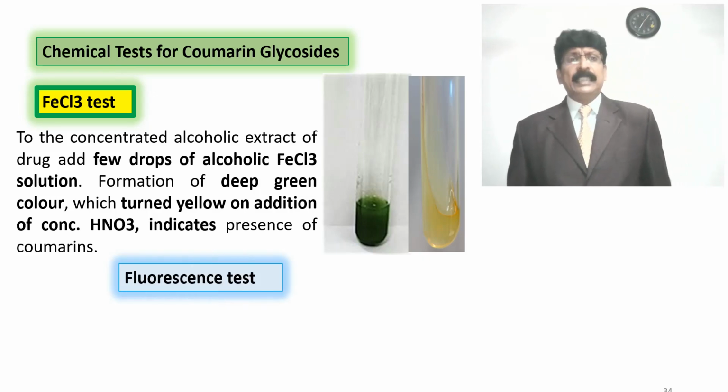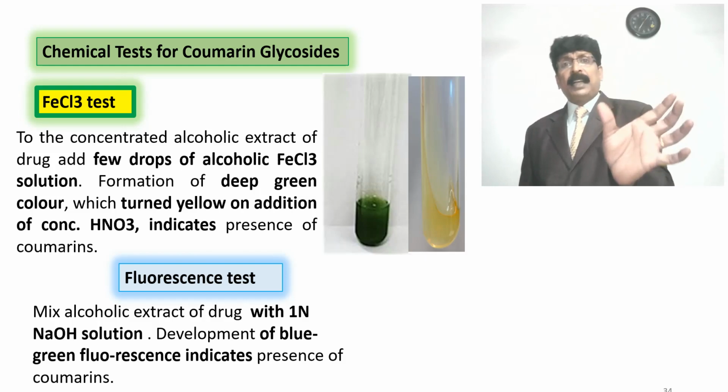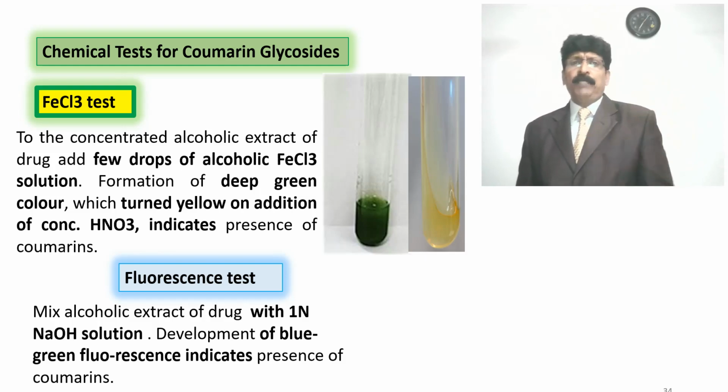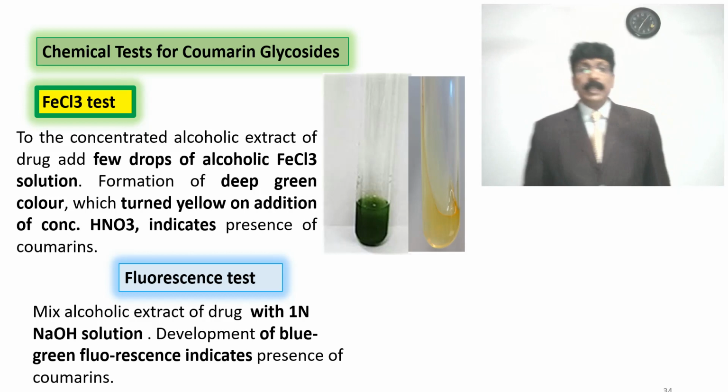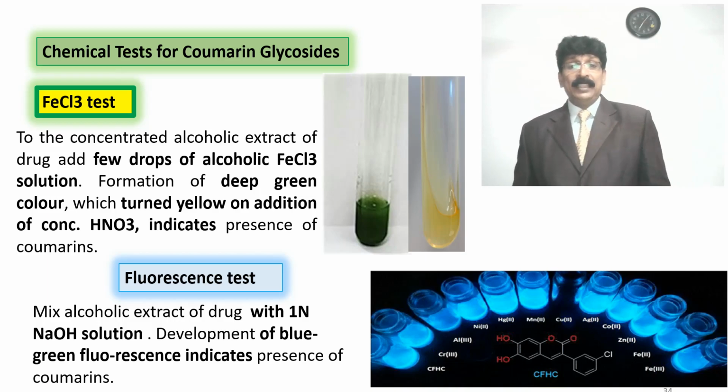Fluorescent test is also there for coumarin. Mix alcoholic extract of the drug, or the plant extract, with 1 normal sodium hydroxide solution. It develops a blue fluorescence as shown in the picture. Blue fluorescence indicates the presence of coumarin.